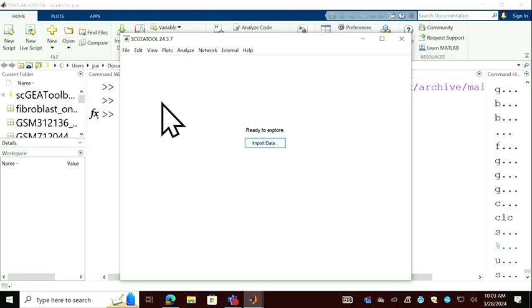Okay. If you are ready, we are going to use example data again to do the highly variable gene analysis. This analysis is to try to identify highly variable genes from one population. There's no comparison, just from one group of cells, and we also require these cells to be the same type and the same states, so a homogeneous population. From there, we will check which genes show this highly variable pattern compared to other genes.